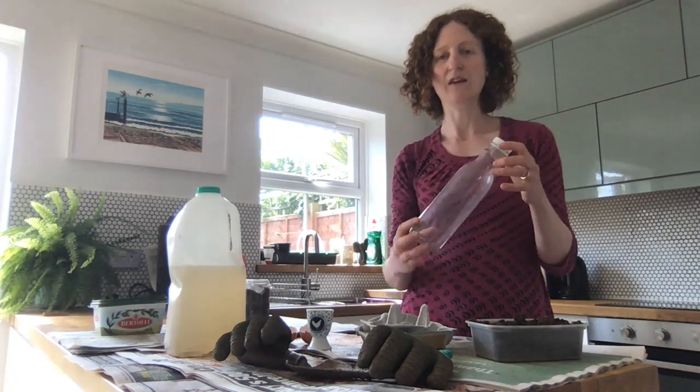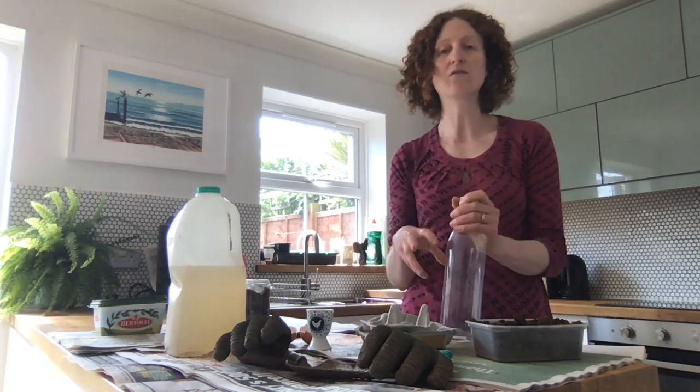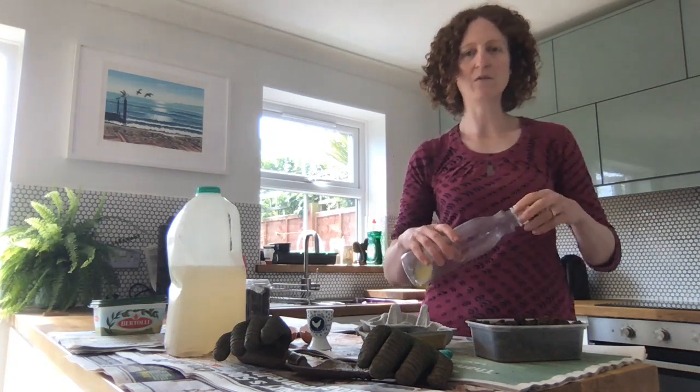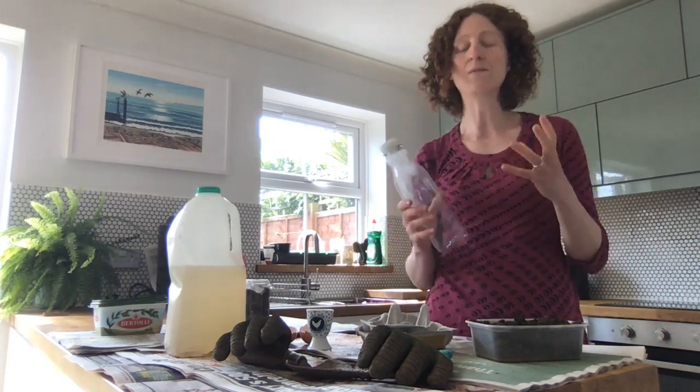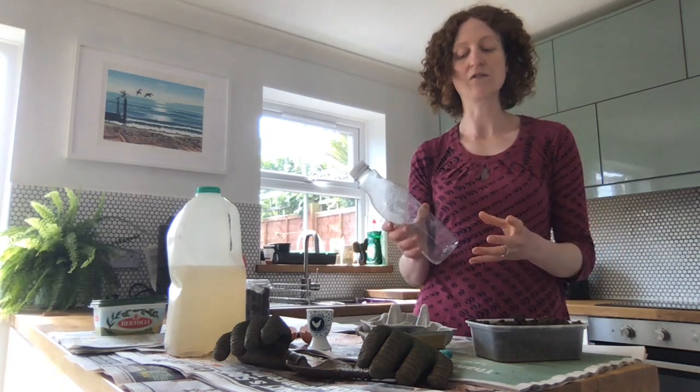So in order to try and see these, we want to try and pick some soil, and not all soil contains all the different bacterial groups. So depending on what soil you have, you might get different groups, and depending on what food you put in there for them to eat, you might get different groups growing as well.